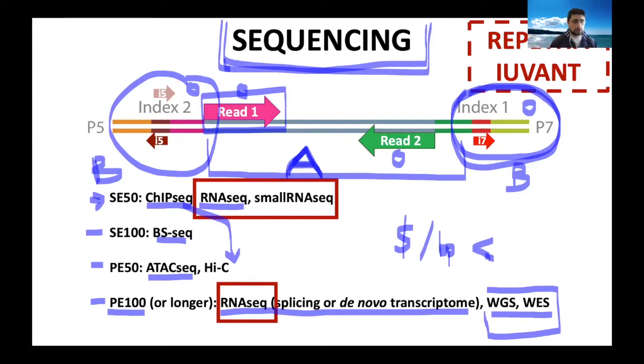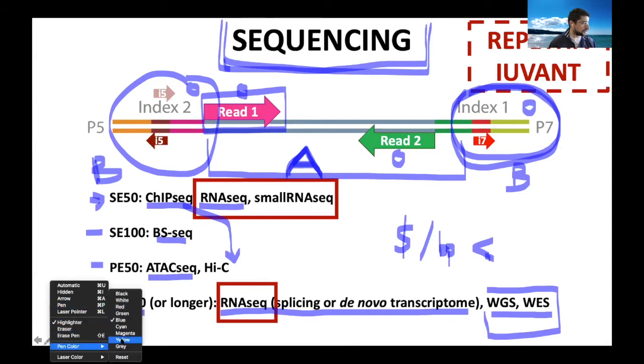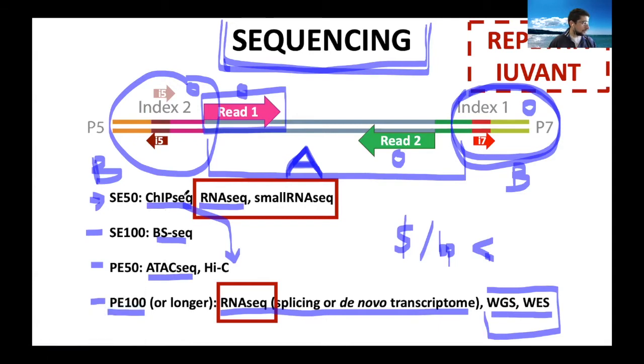But again, before we are doing some specialized DNA library preparation, and so we are talking about ChIP-seq, we're talking about bisulfite-seq, we're talking about ATAC-seq, and that's it. So these two, we did it yesterday. So we're not doing this anymore, and we're not treating Hi-C. It's a very complicated protocol. It's not very common, but if you want to know more about it, I'm happy to discuss that in private with you.